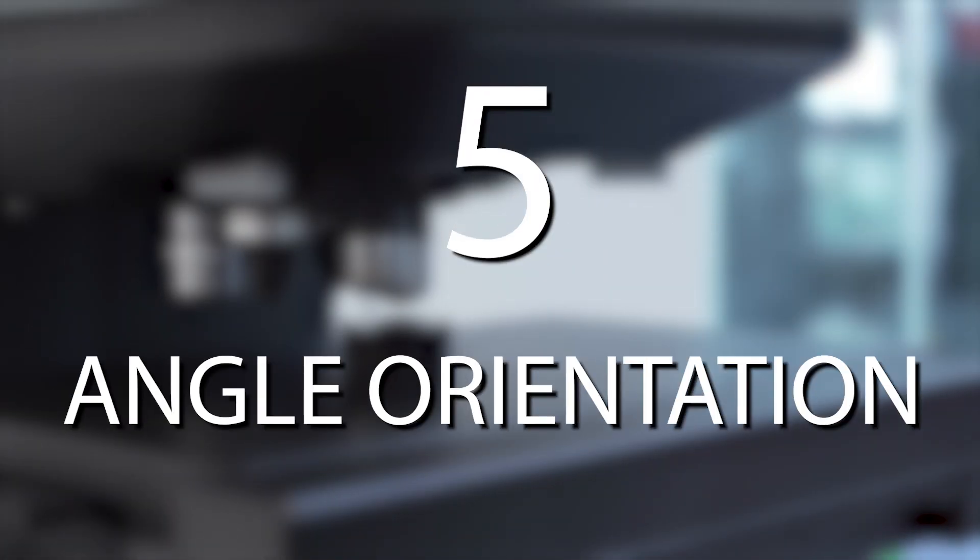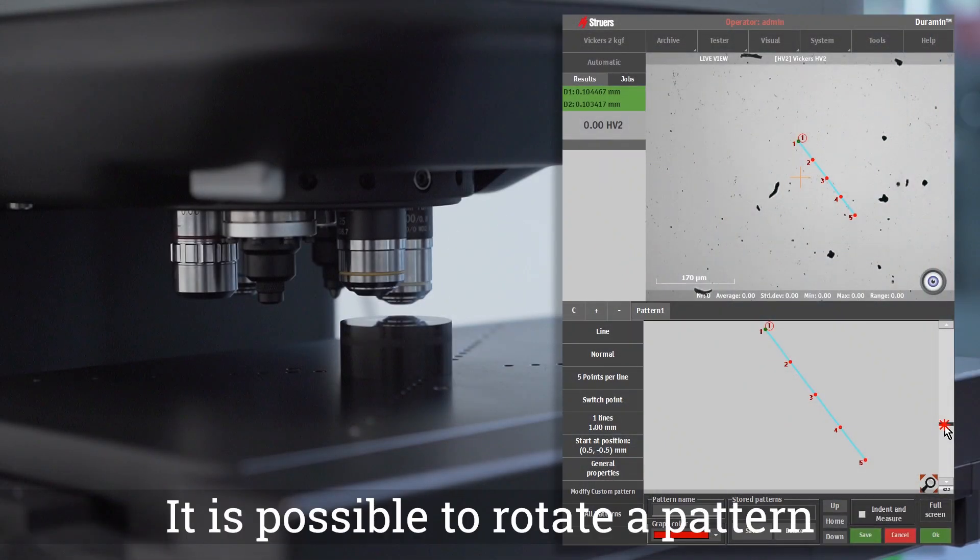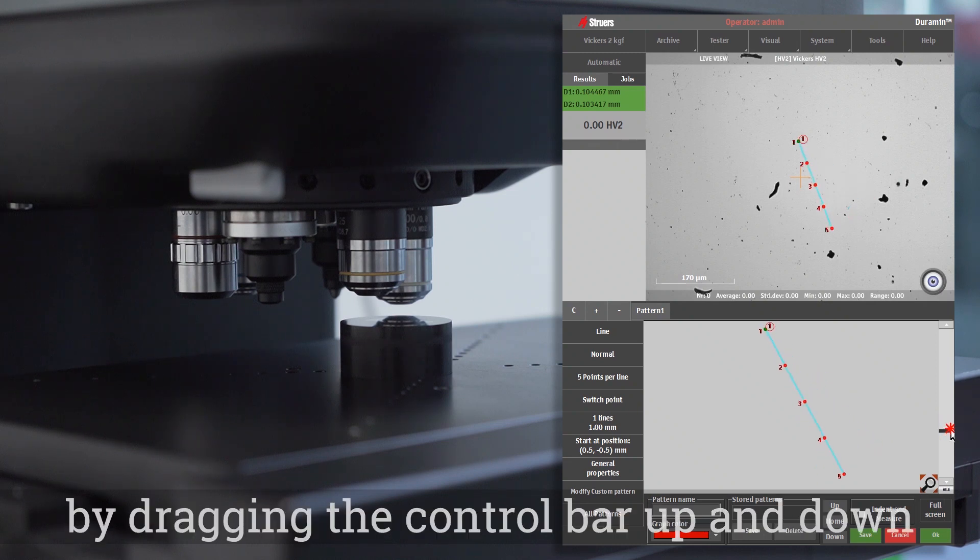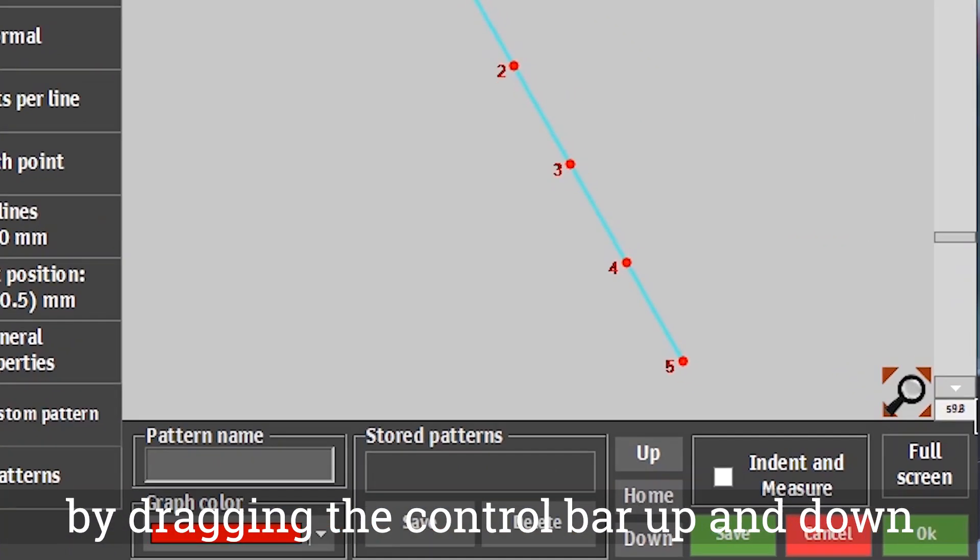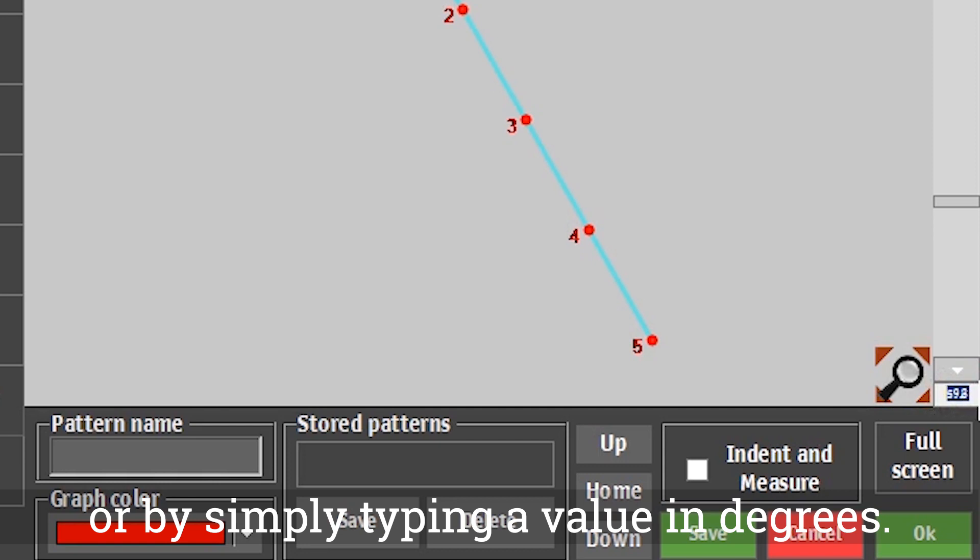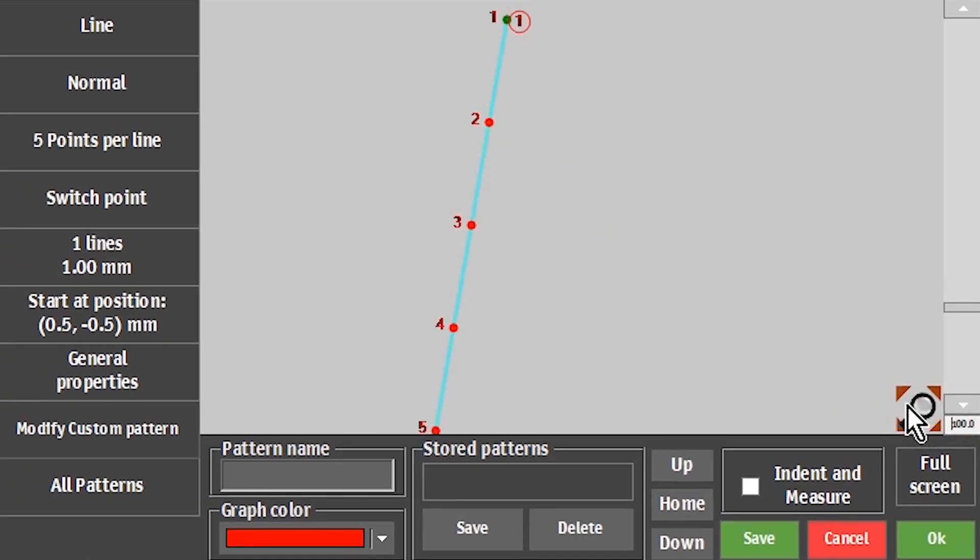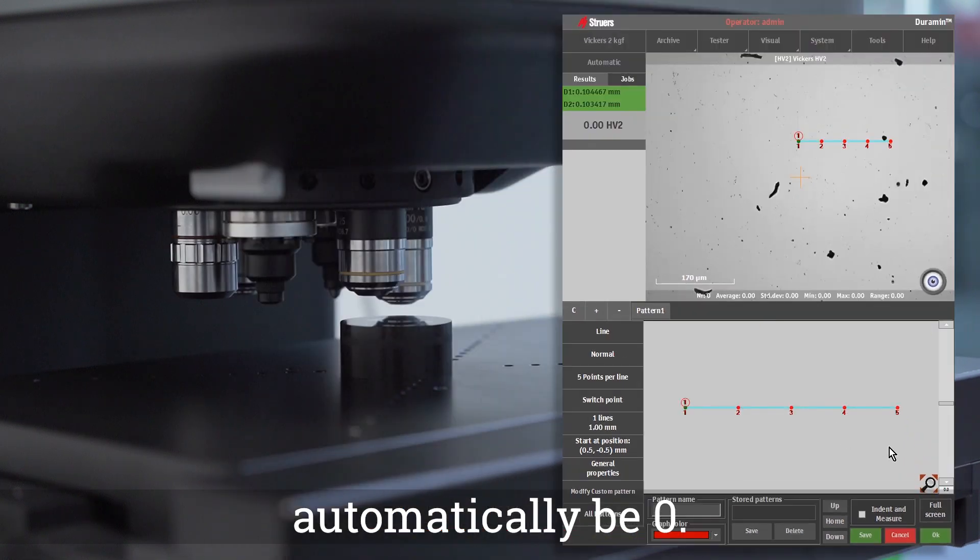Angle orientation. It is possible to rotate a pattern by dragging the control bar up and down or by simply typing a value in degrees. By double-clicking, the value will automatically be zero.